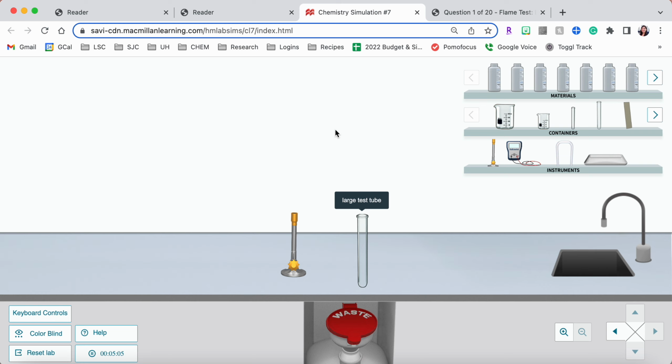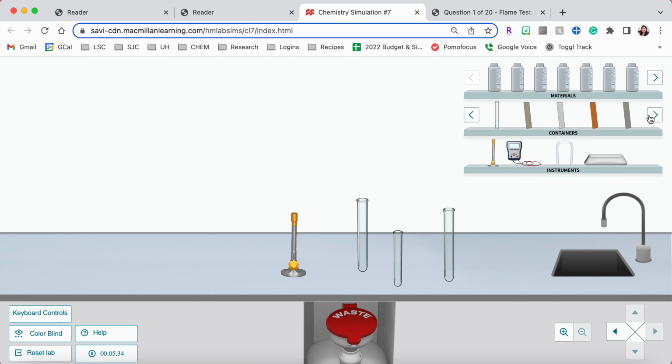So I went ahead and put the PPE on, and I entered the lab, and I brought over some of the things you'll be using. So you will be using a Bunsen burner, and you'll be using some test tubes. Now, luckily for you, you can always get new test tubes if you need, bigger one, smaller one. But here I just brought some over just so you can see them. They stand on their own like this. In a physical lab, you would need a test tube rack. But here in this virtual lab, we have an easier situation where we don't need that.